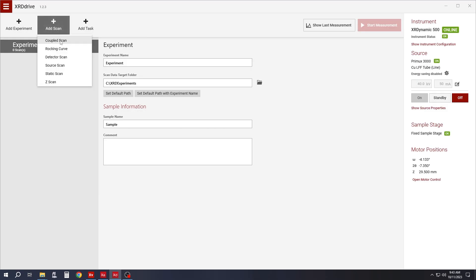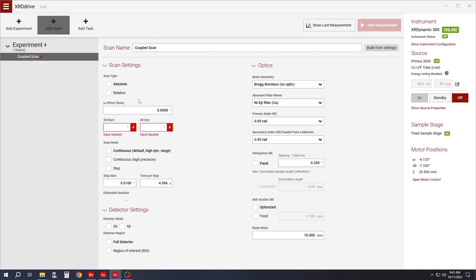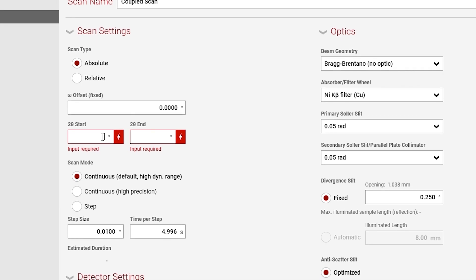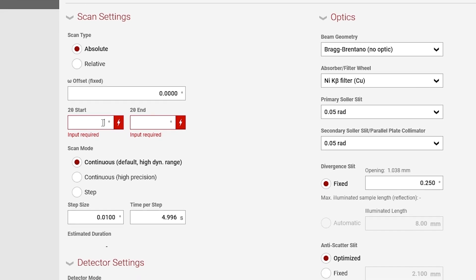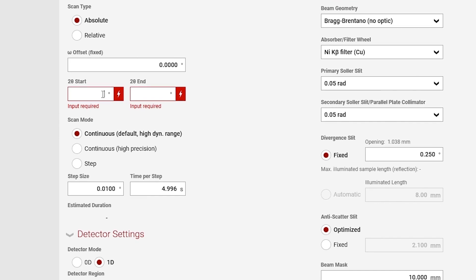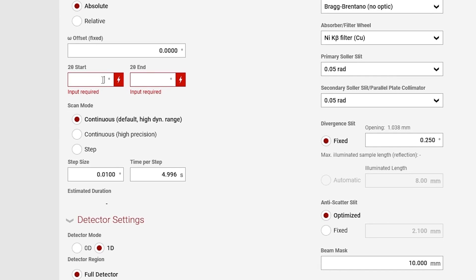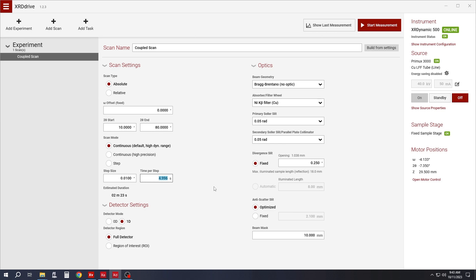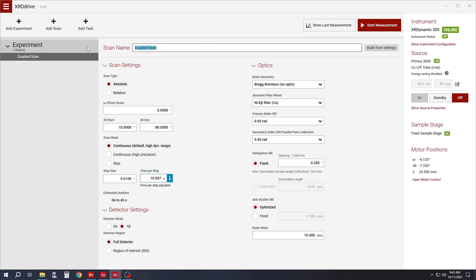In the software we choose coupled scan as the scan type for reflection measurements. Other parameters are set as default values, but can be changed according to sample size and type. Typically, the 2-theta range is adjusted based on the sample type as well. For graphite samples, most peaks will be between 10 to 80 degrees 2-theta. Then we can adjust time per step depending on the quality of the outcome data required.